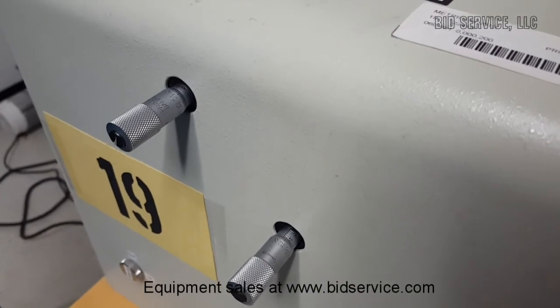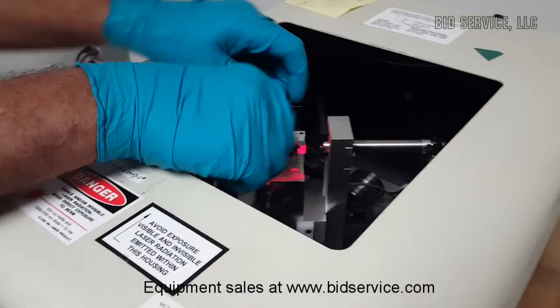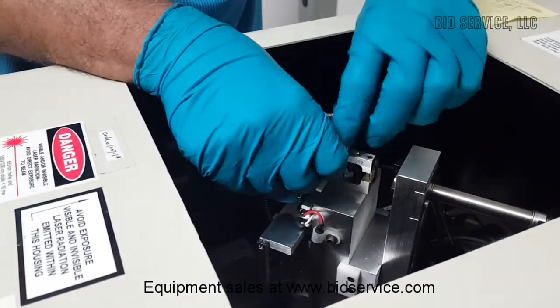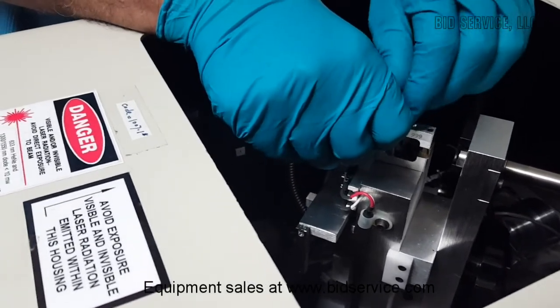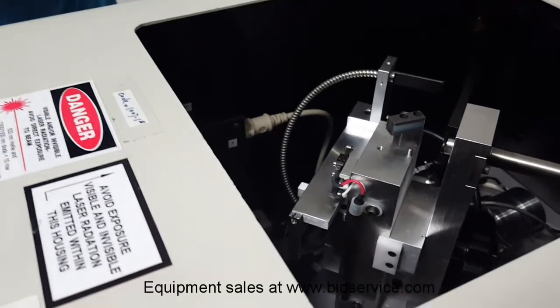Once it is achieved, these numbers should be recorded. I'm going to show how to remove the prism right now. I'm going to turn off the laser for safety. The top thumb screw has to be removed, and then you can rotate it like that and take it out.